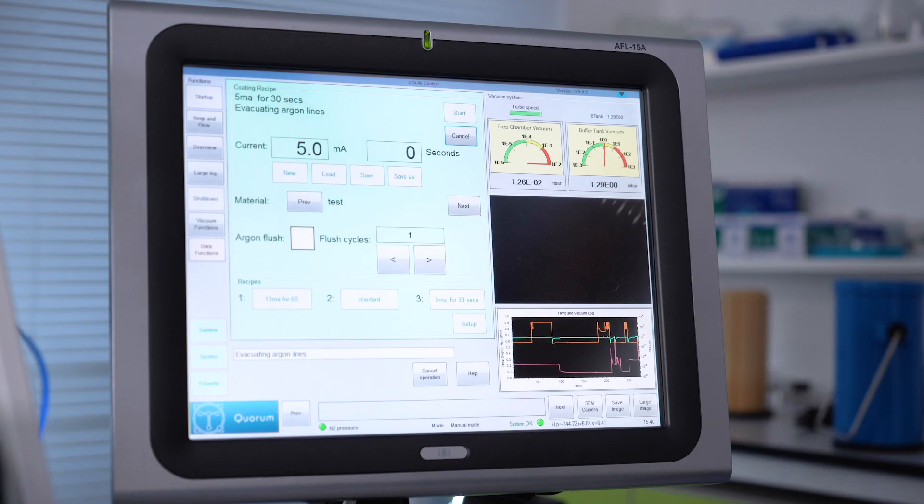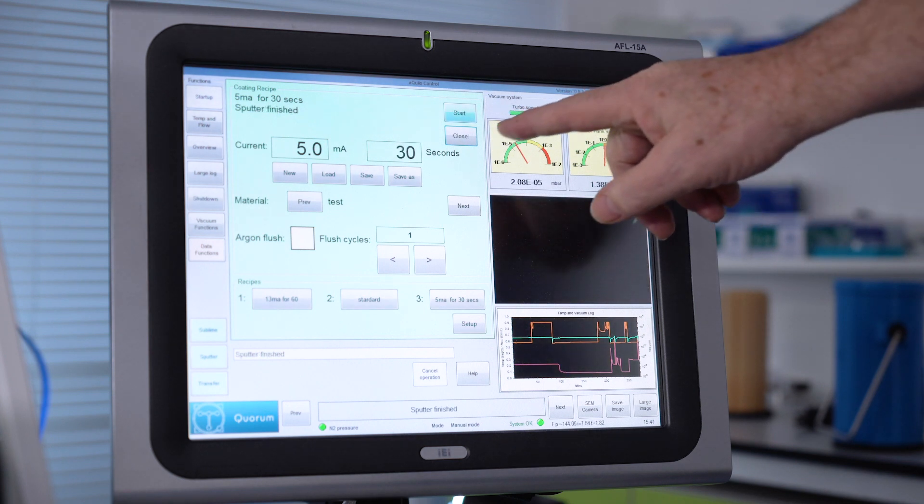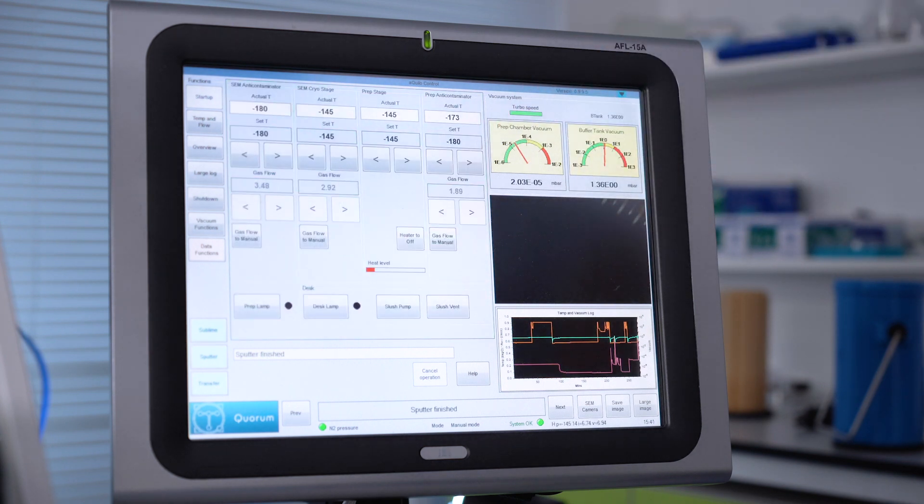And once it has coated for the correct time, it then pumps away the argon lines and goes back to system ready. So we can now close the sputter window and transfer the sample into the microscope.